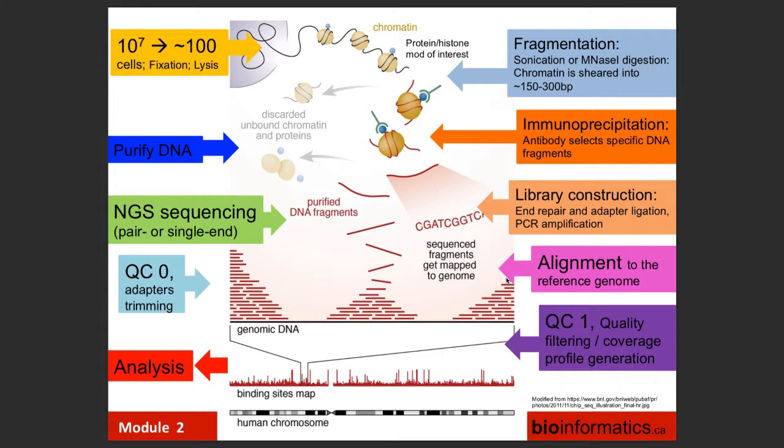So now, this is an overview, and this is almost our final result, when we have reads agglomerated on top of, in this case, a human chromosome.